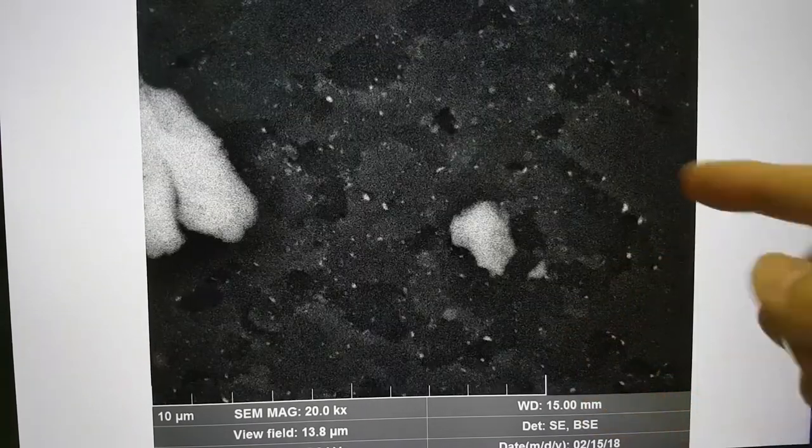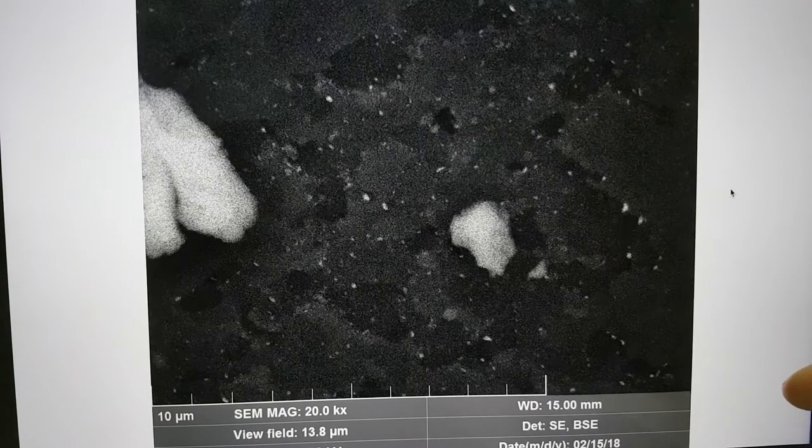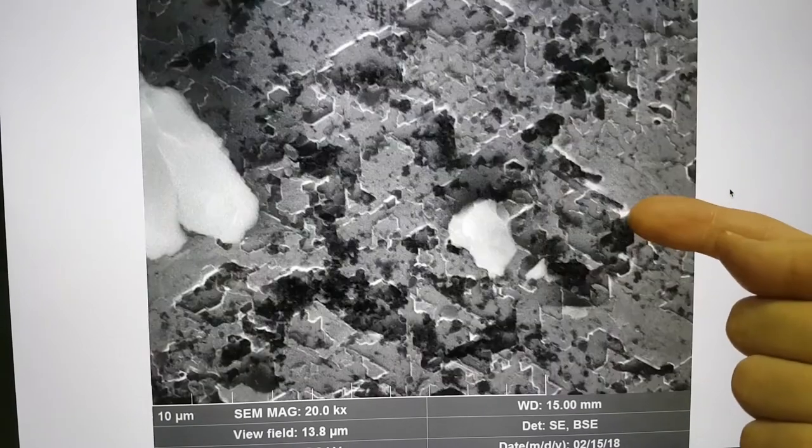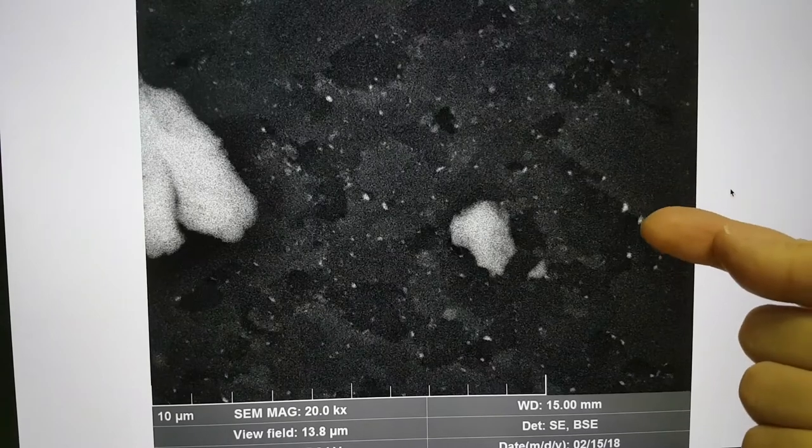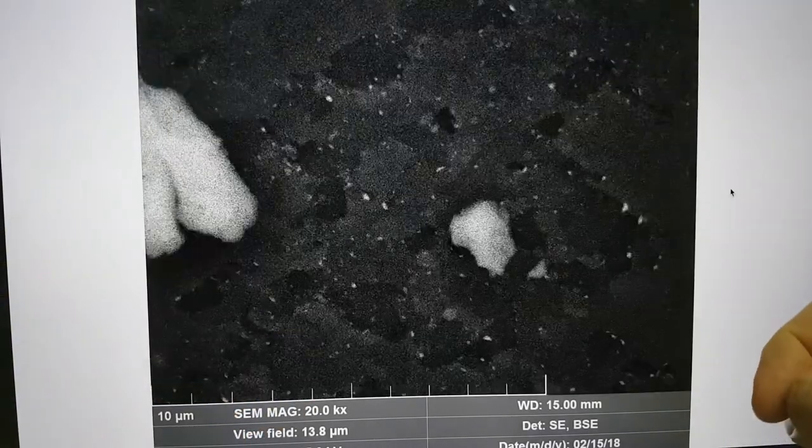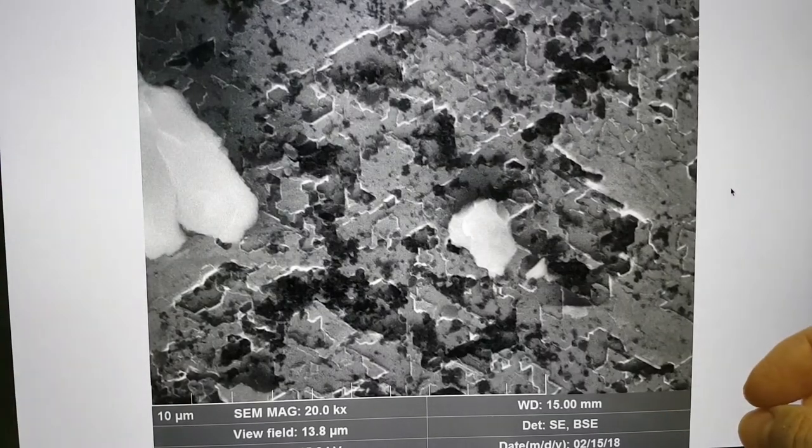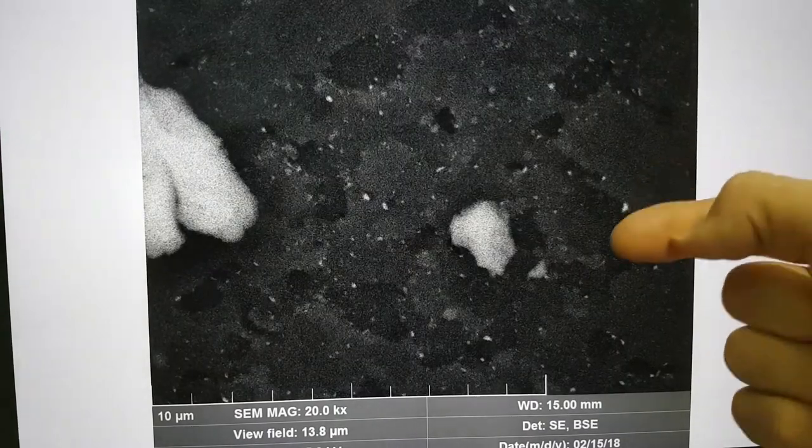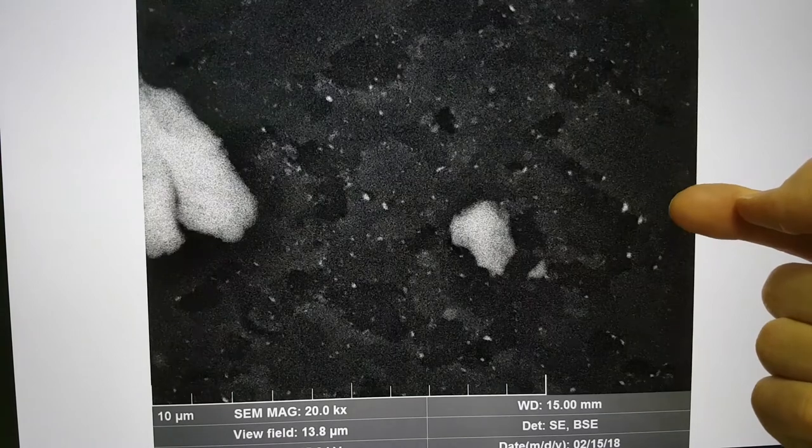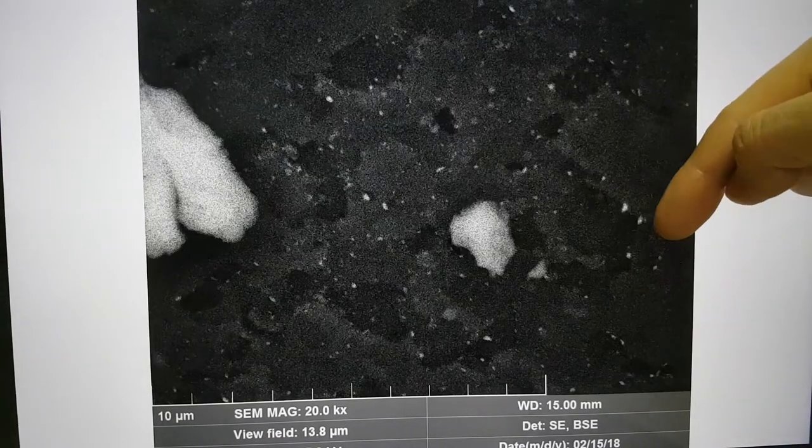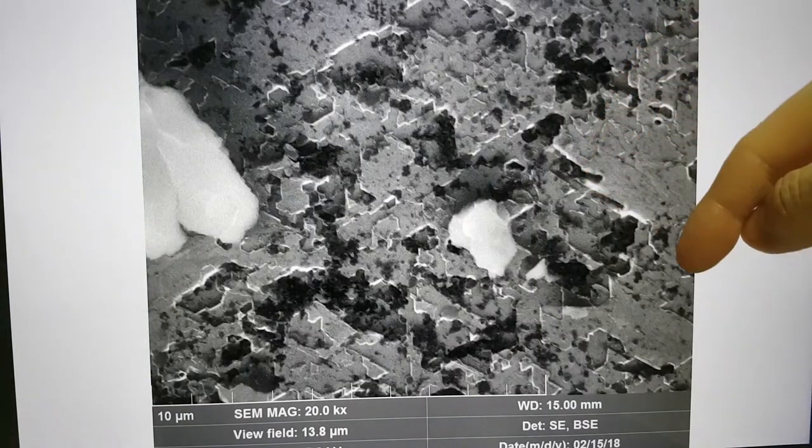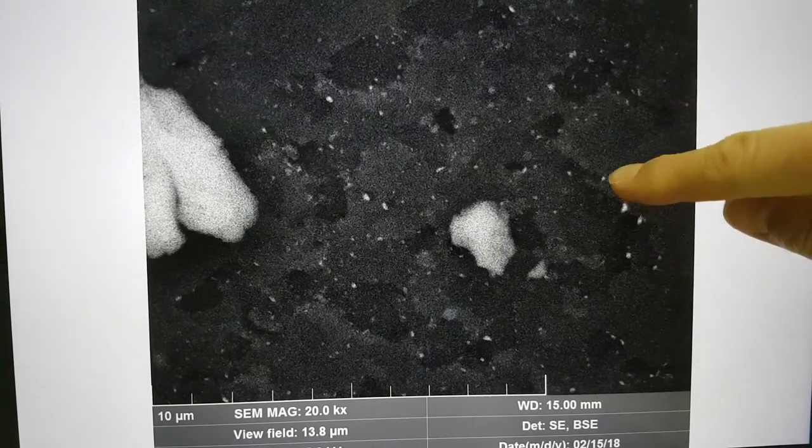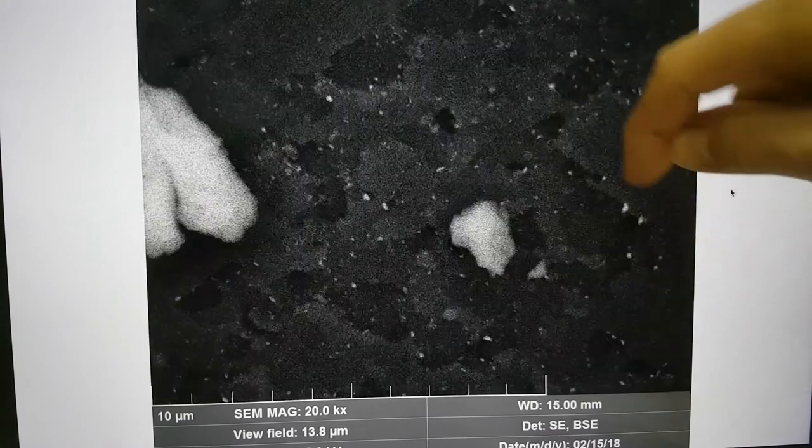In the backscatter image, elements that are heavier will appear brighter. The bulk of it that you're seeing, this area here for instance, is carbon. What you're seeing with these white areas are a heavier element, typically silicon or calcium or aluminum that we found spotting all over the large overview of these diamonds. This whole notion of it mining, what you have here is three tracks in a row where they all seem to be moving in this direction.